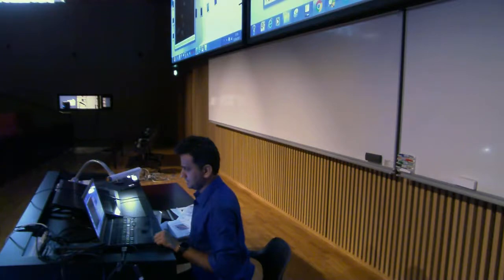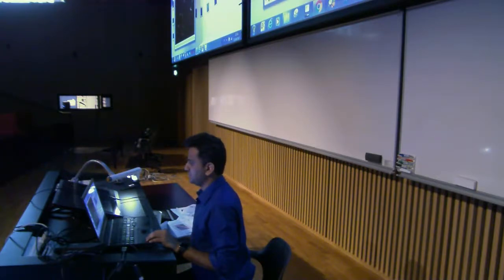See here, this is the time-lapse data, and people are interested in knowing this influx of calcium or whatever. You guys know better than me. If you have a region of interest here, you can quantify that data and then fit a curve of recovery or decay, both.